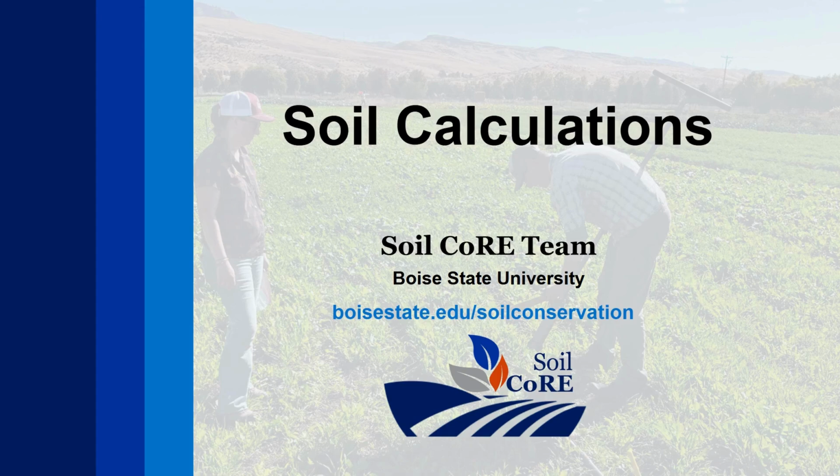Our group, the Soil Core team, received funding from the USDA and NRCS to help train qualified individuals to perform soil health testing. The goal of this CEMA is to monitor soil carbon before and after an NRCS implemented conservation practice. Resources complementary to the information found in this module can be found at boisestate.edu/soilconservation.